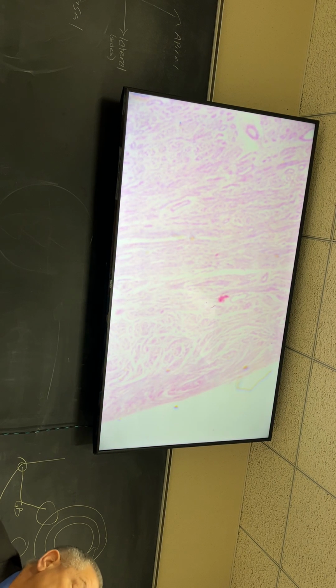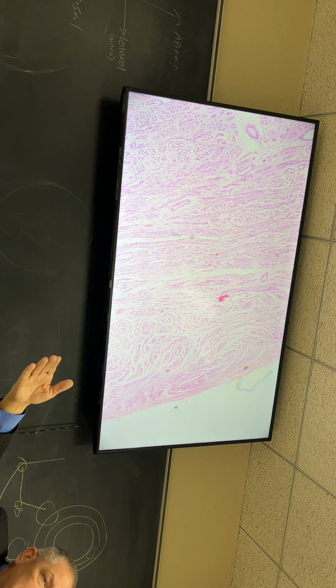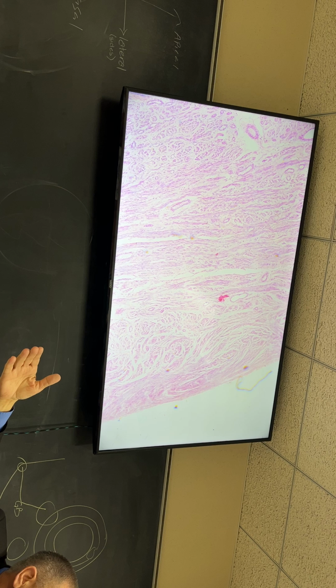Histologically, it's relatively hard for me to show you this, right? And the reason for that is why? Thick, big, right? Got lots of layers, right? I can't show you, even on my lowest power, the whole structure in one shot.